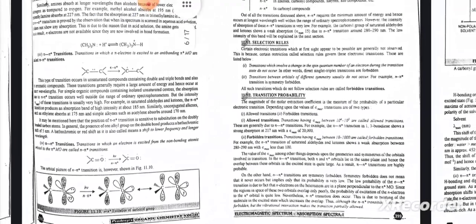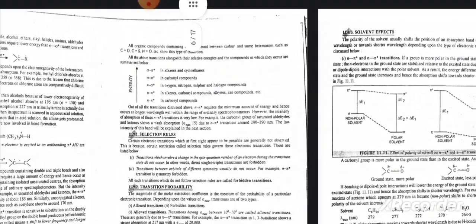It may be mentioned here that the position of the pi to pi star transition is sensitive to substitution on doubly bonded carbon atoms. In general, the presence of one alkyl group on the double bond produces a bathochromic shift of 5 nanometer. A bathochromic or red shift, as it is also called, means a shift to lower frequency and longer wavelength. n to pi star transitions: transitions in which an electron is excited from a non-bonding atomic orbital to the pi star molecular orbital are called n to pi star transitions.